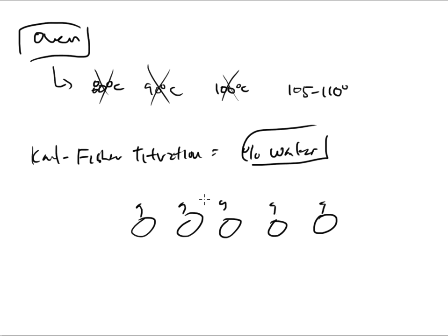It's very important that you obtain the masses, and it's very important that you label the weigh boats that you use, because the ovens will be shared by everyone in the class. So you want to make sure that it is what it is, and that if someone goes in and switches those boats on you, you'll know your location and your label, so that way you know exactly what the substance identification is when you remove it from the oven after the heating period. Okay? So we're going to put these into the oven.